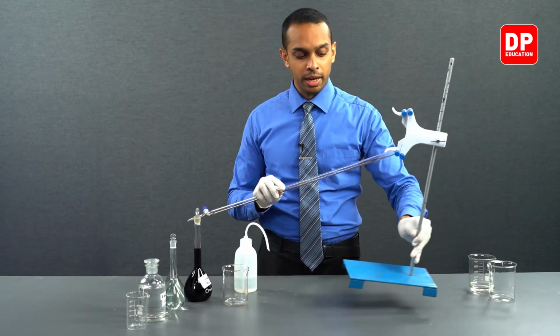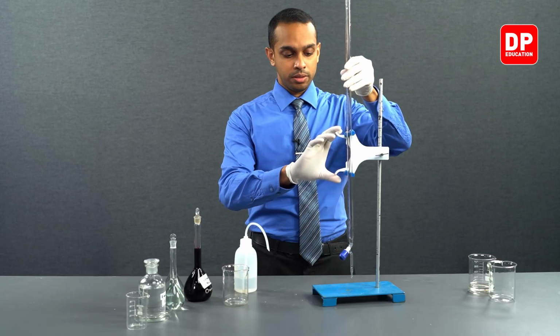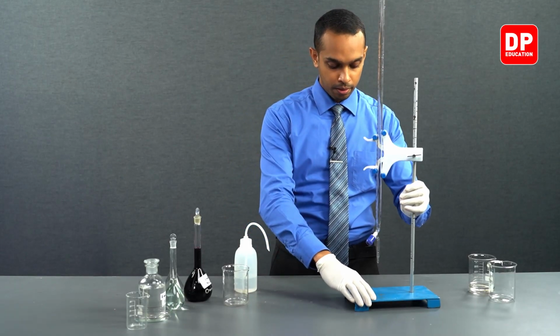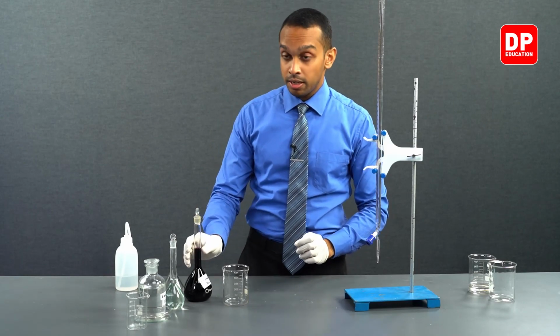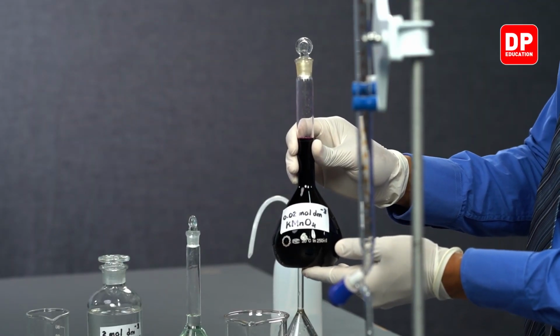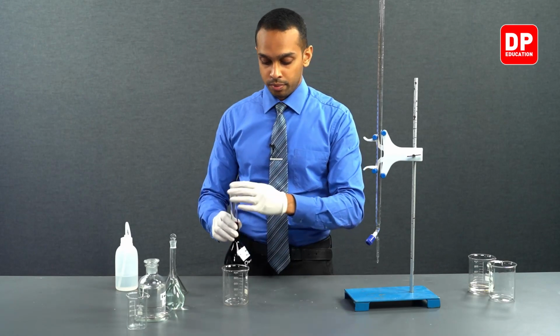In order to do that, I will take the retort stand again and fix this burette like this. And then transfer some of the solution that will be used to fill this burette in the titration.